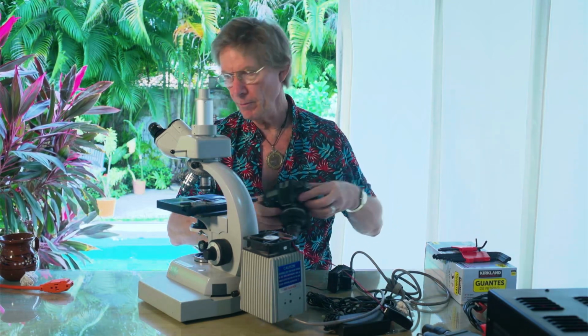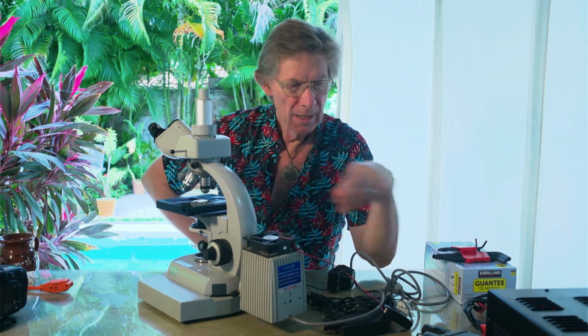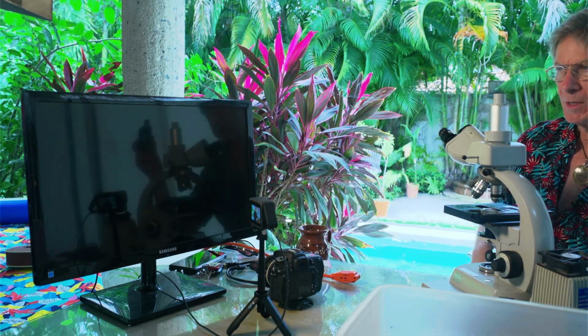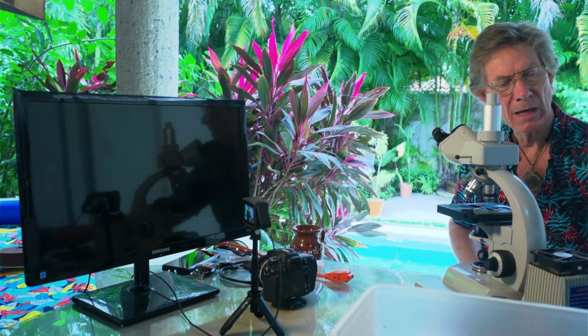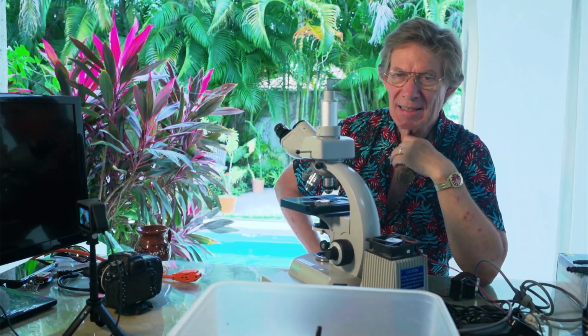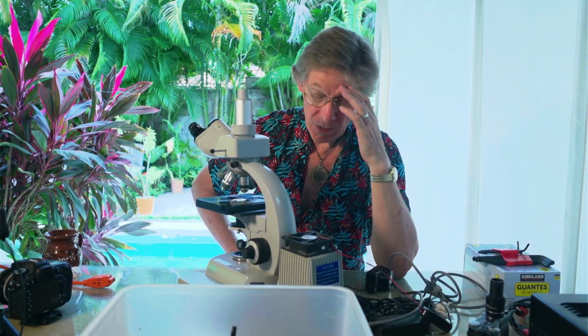What about the video out, Ross? Cameras need something called video out. And some cameras, you can hook up a live monitor to the camera, such as this monitor here. Now, in my live blood lab, in my clinic, I have a 50-inch 4K television monitor that I use for live blood imaging. And it's incredibly striking.